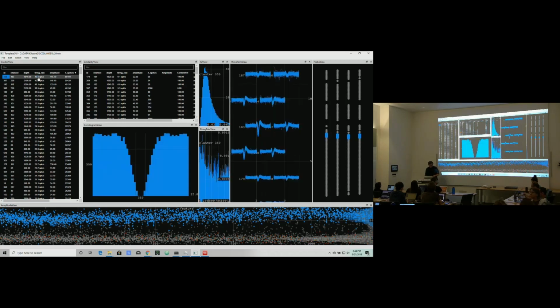Now I'm just going to click back on this one neuron so we have it alone. This is the autocorrelogram of this neuron, spikes with itself. If you're not very familiar with this, all that's happening is we're going through our list of spikes from this neuron and histogramming ISIs from this spike to the next one to the next one. There should not be any very small ISIs, because we know neurons have refractory periods. They cannot fire again after they've just fired.